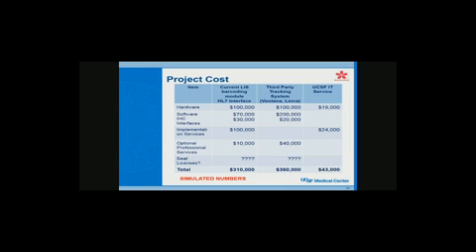So those are things that you really have to look at, and those are the things you have to kind of flesh out a little bit, at least before you even start asking for the money. We spent about a year just looking at different systems and getting some gross quotes from them. They weren't detailed quotes. They were just kind of, this is the ballpark type quotes. And before we even started asking for the money, so we had an idea of what we were looking at. And then we padded our request, of course, in order to cover contingencies.